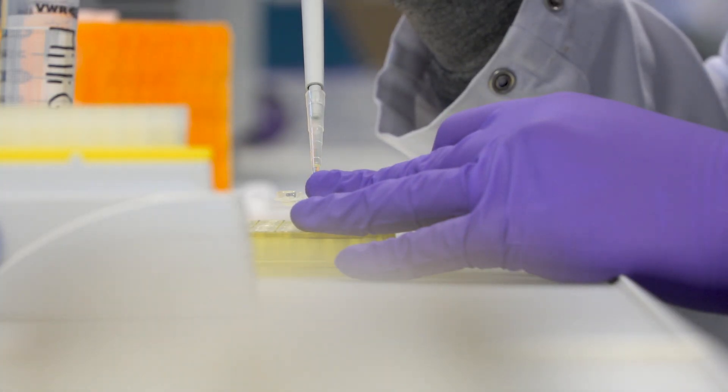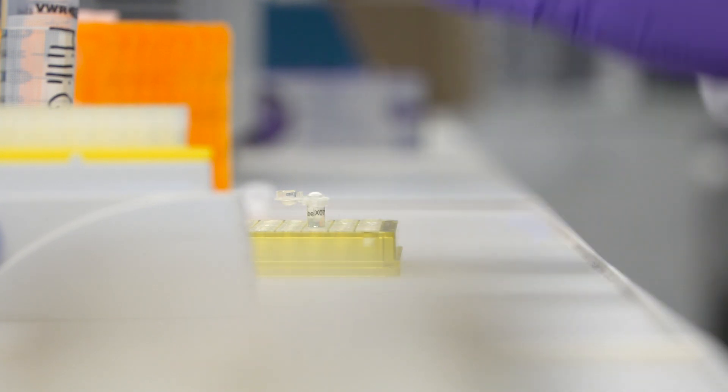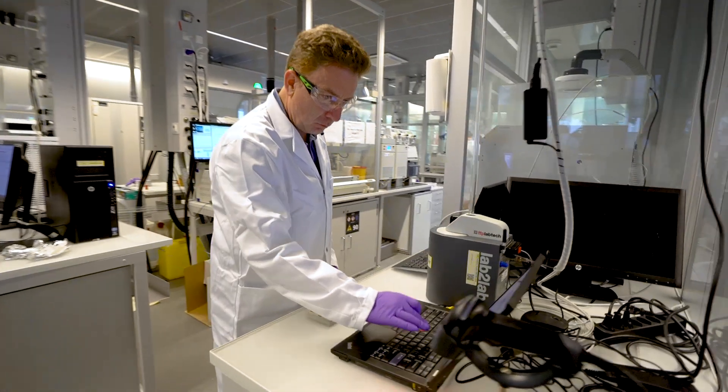Before lab-to-lab, Novartis scientists had to hand carry their samples to their testing equipment, equipment which was far from their experiments.